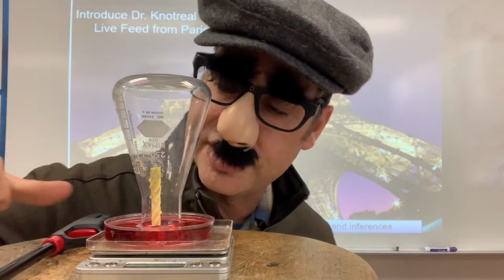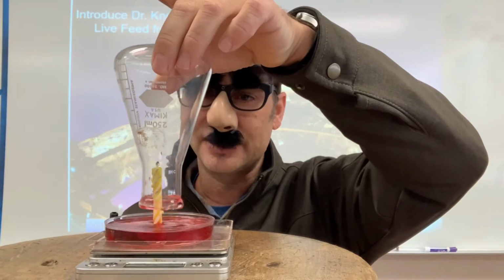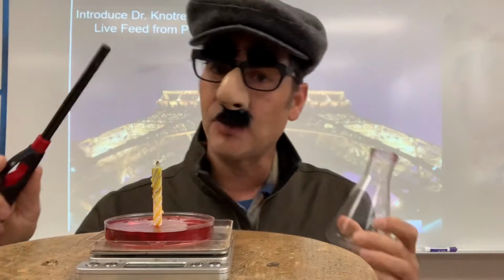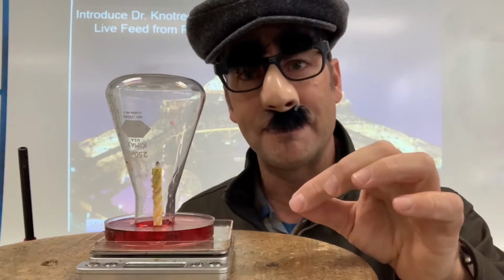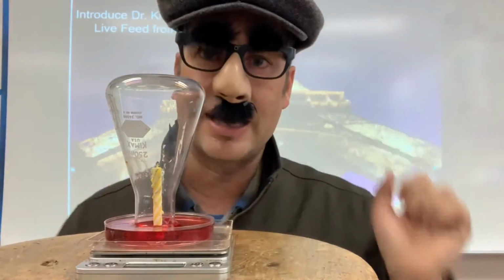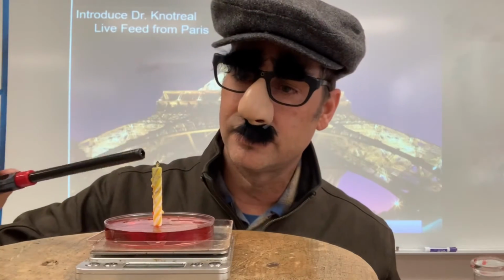Welcome to part 2 of this series. So now that you have got your observations, now we are going to light the candle. I will show you what to do. So we take this out very carefully. Try not to get the wick too wet. What we will do, and you might want to take the mass before you do this, so maybe you turn it on and you take the mass, zero it out, put everything on, take the mass, and then maybe what you do is you light the candle.